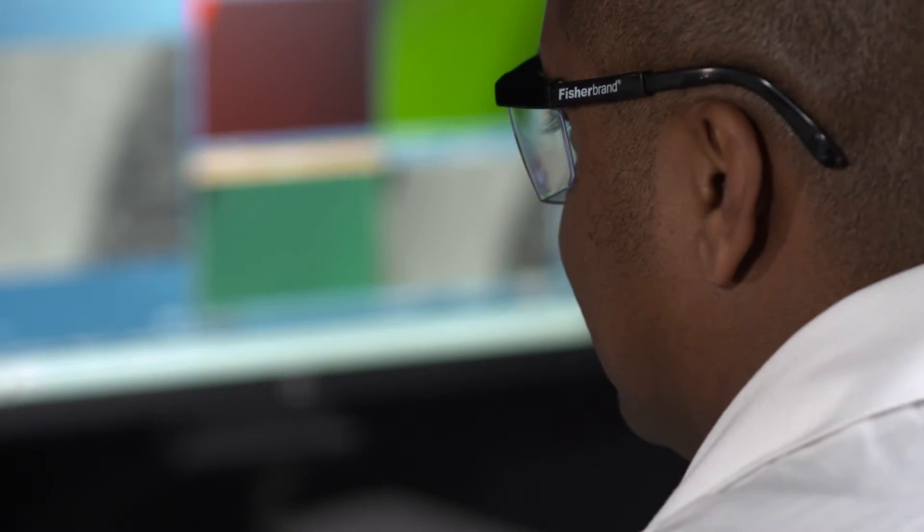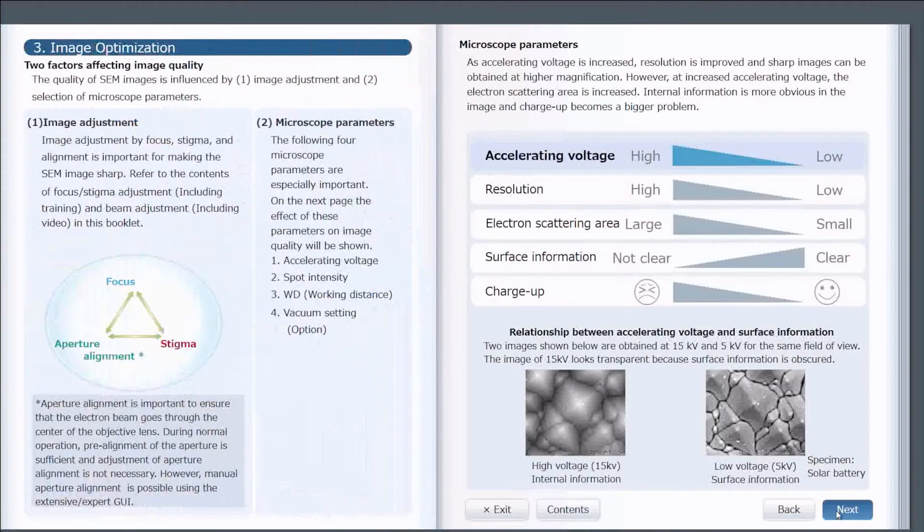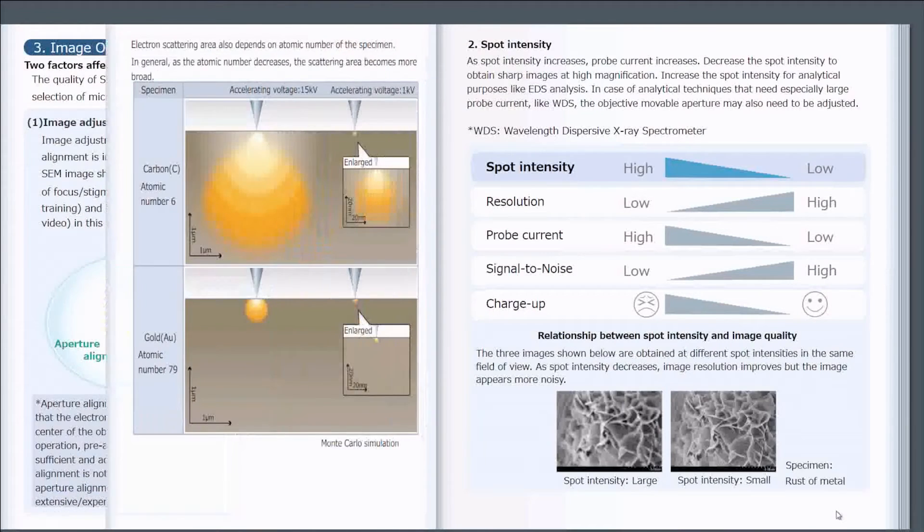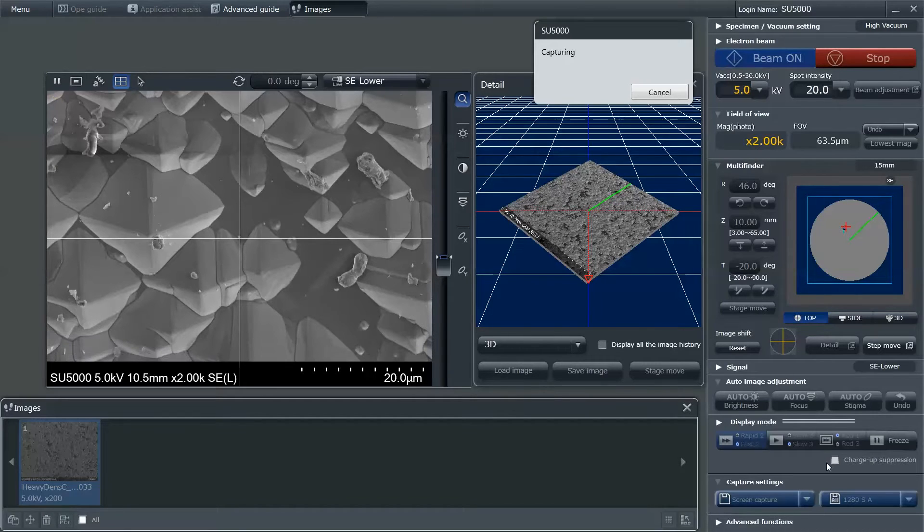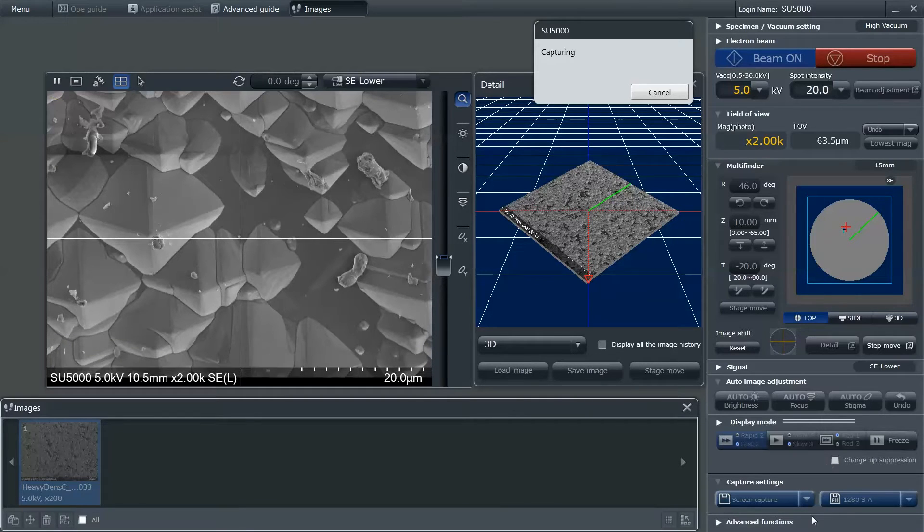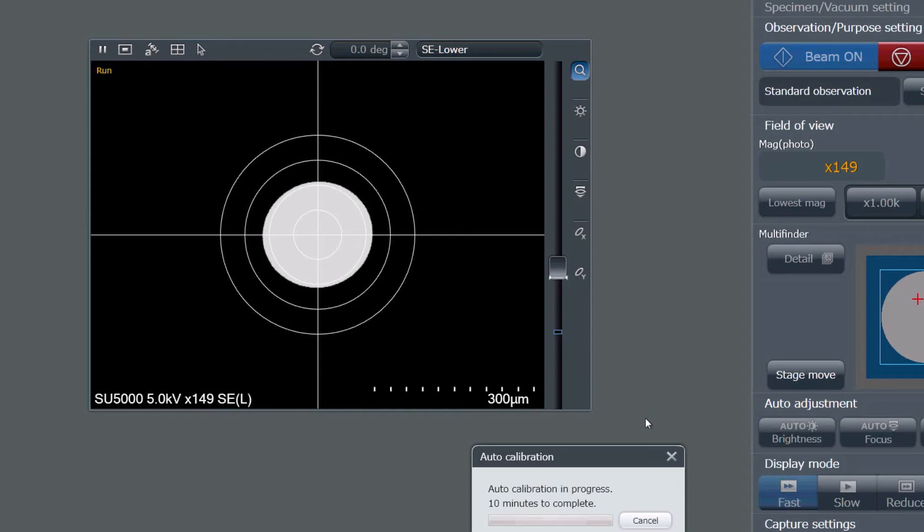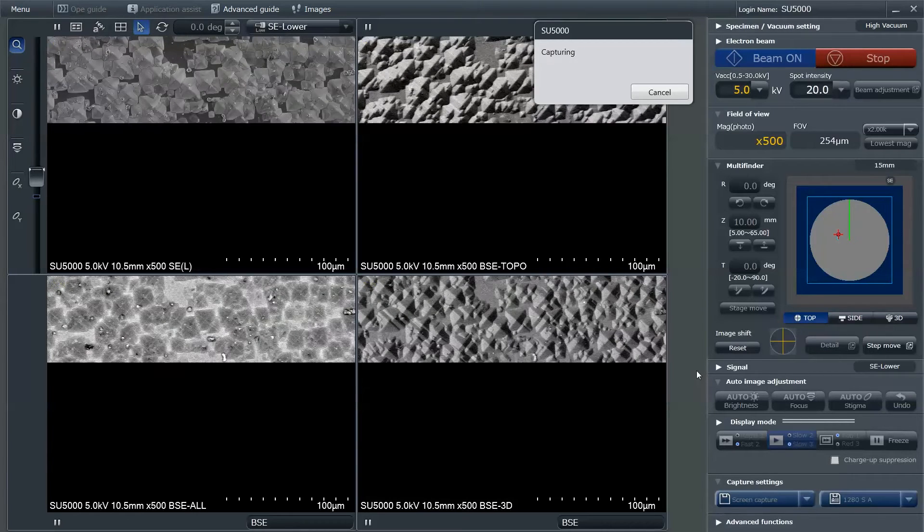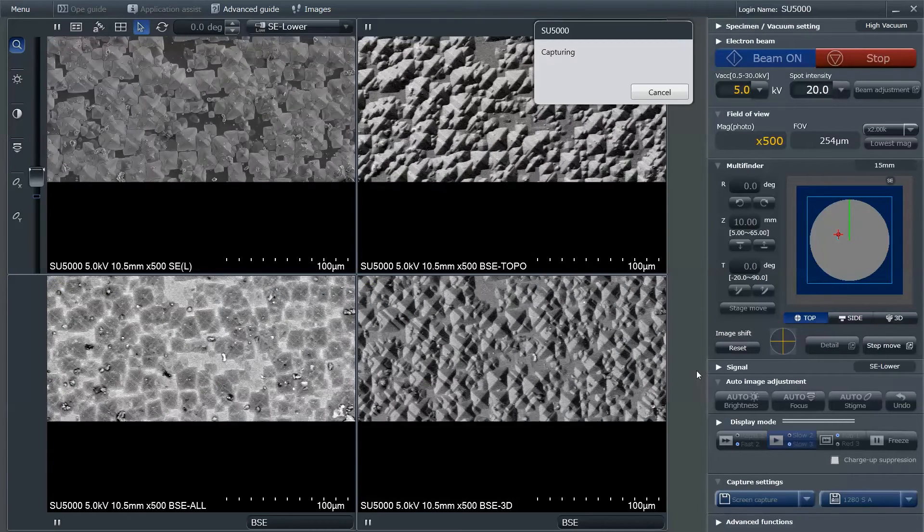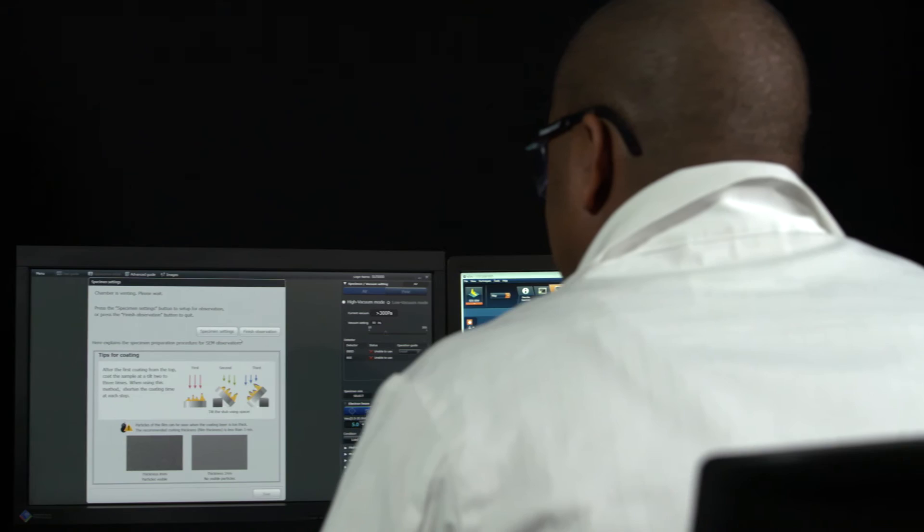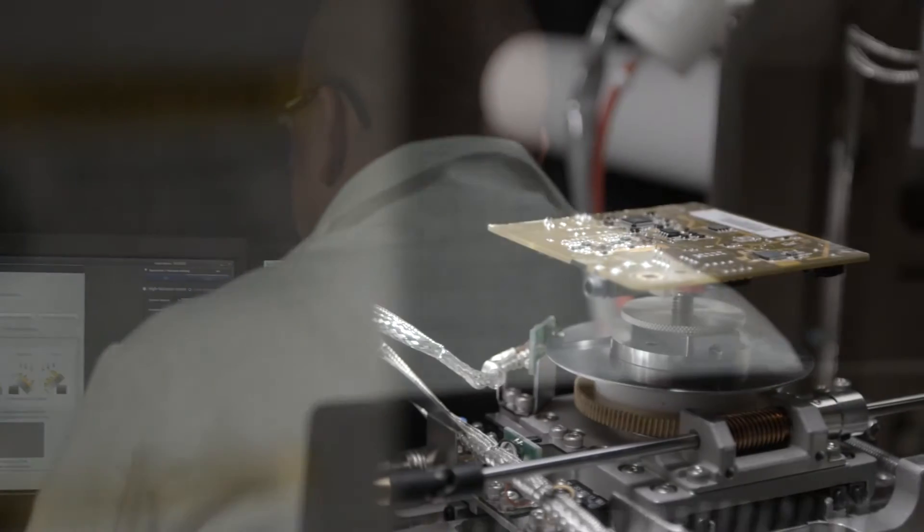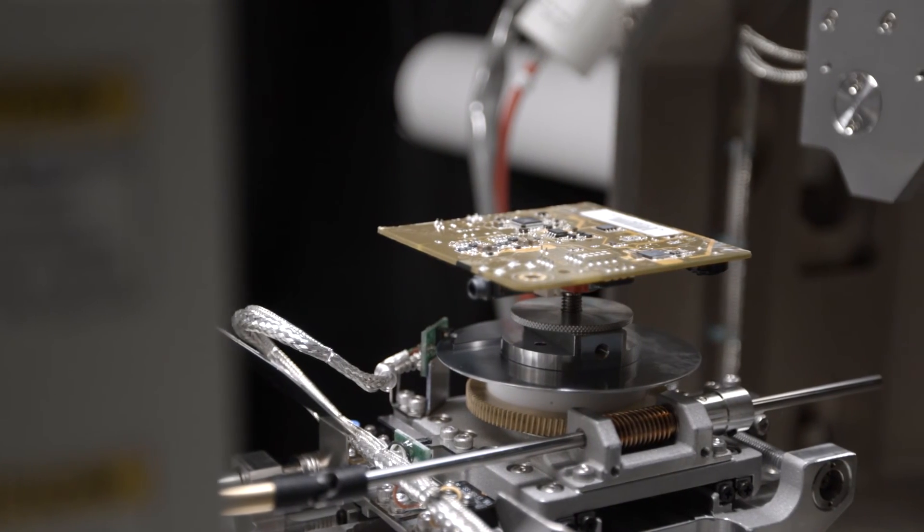Experienced and novice SEM users alike will appreciate the specimen preparation and application assistance guides of the GUI, complemented by the multi-finder graphical stage navigation, which provides improved sample-to-image correlation manipulative controls on the GUI display, and more importantly, safe multi-dimensional manipulation of the sample's position inside the specimen chamber for safety.